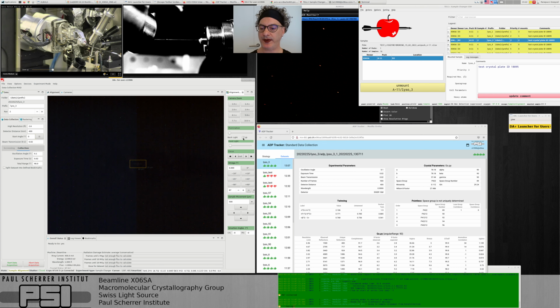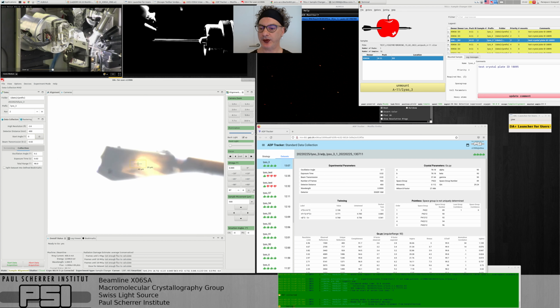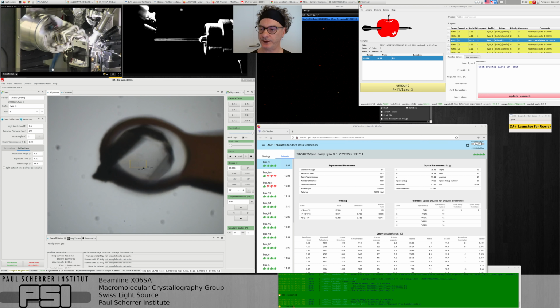We can put the lamp back up so we can have a nice view of the sample. Very good. There we are.